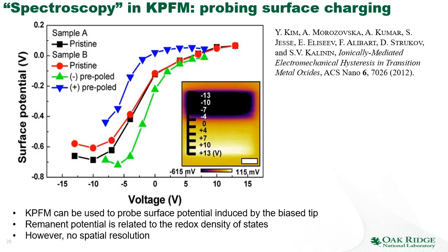So why does it happen? It happens because the surface of the dielectric can be charged, but the degree to which it can be charged depends on the transport properties of the surface. So if you apply too strong a bias, then the transport mechanism due to ion diffusion or semiconducting transport becomes activated, and the surface cannot support this potential anymore.